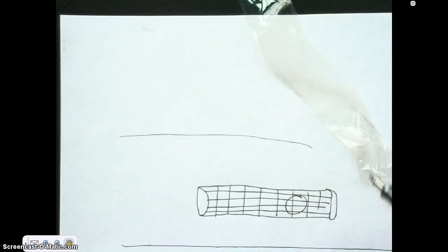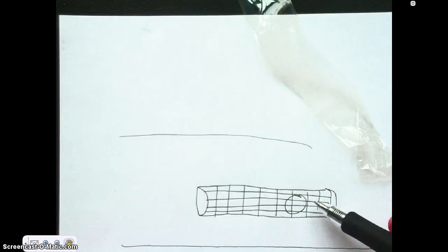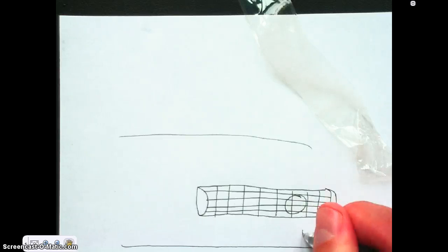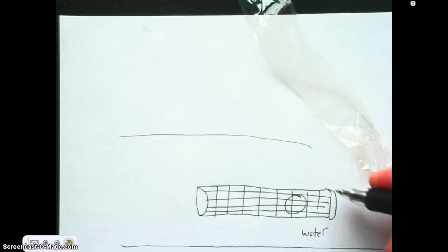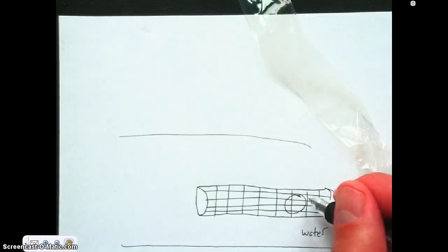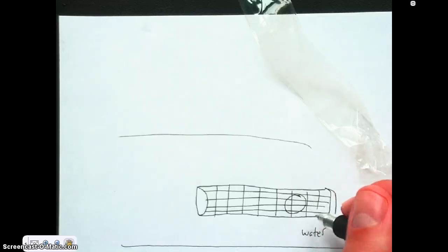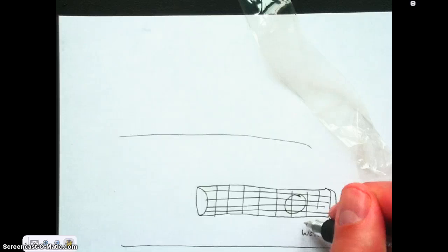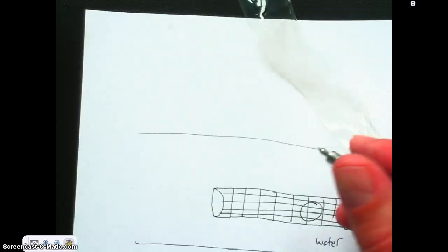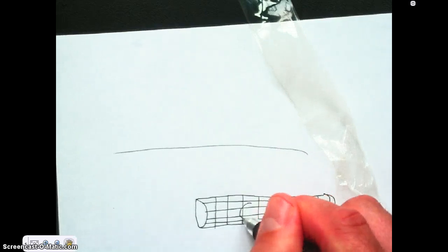Now, red blood cells, inside of the tubing is where the blood is. And so there's obviously a higher concentration of red blood cells inside of the tubing compared to outside, because this is water out here. But I'll write water right here. So these red blood cells, as much as they want to go from an area of high concentration of blood cells, which is on the inside, to low concentration, which is on the outside, they can't get out because these holes aren't big enough to let them out. However, I'll put another red blood cell there.